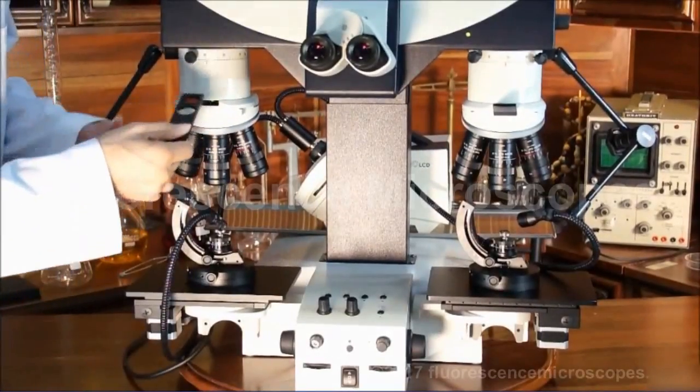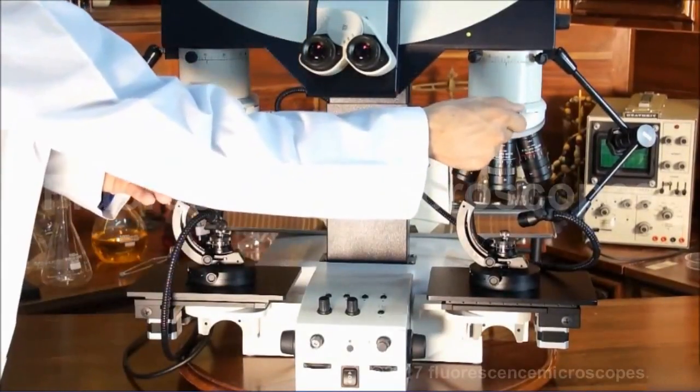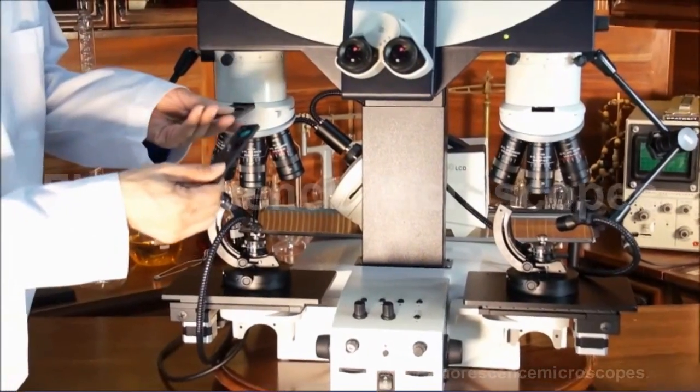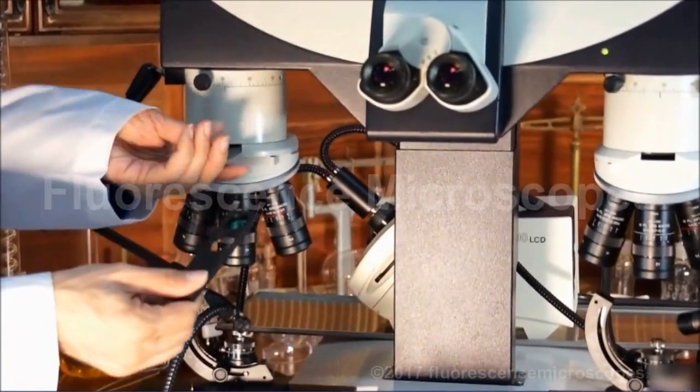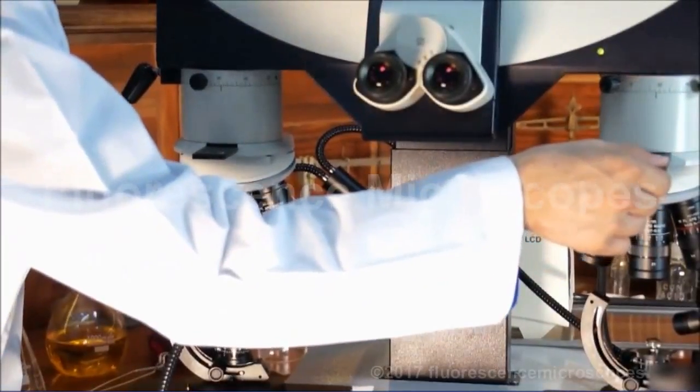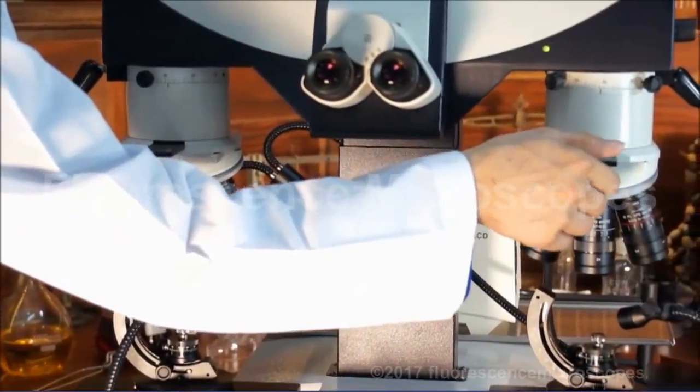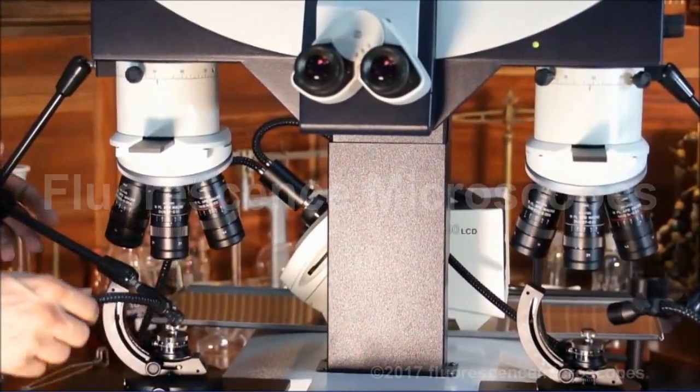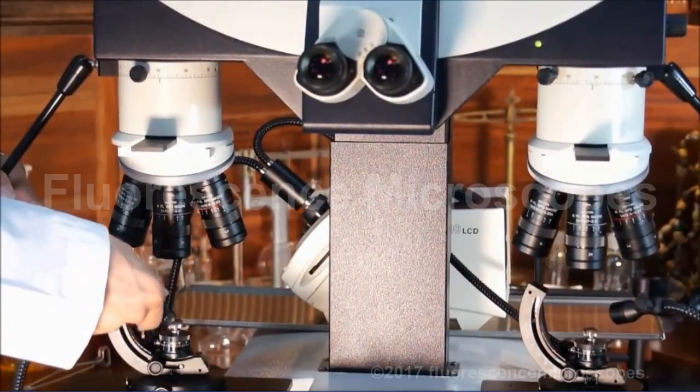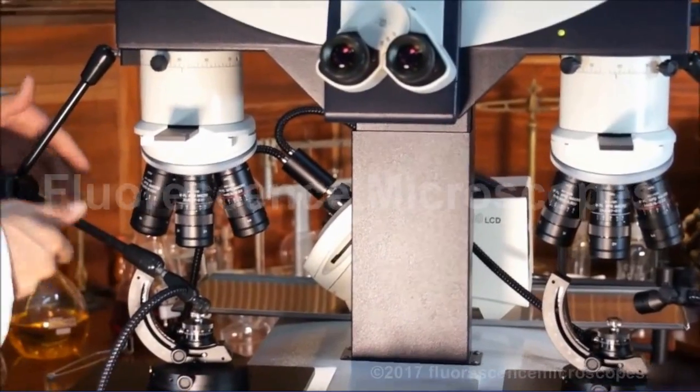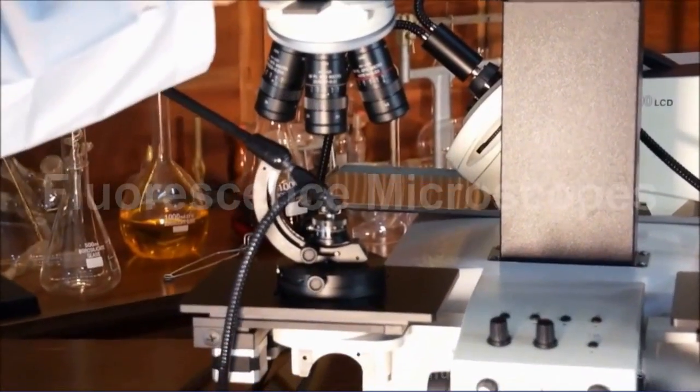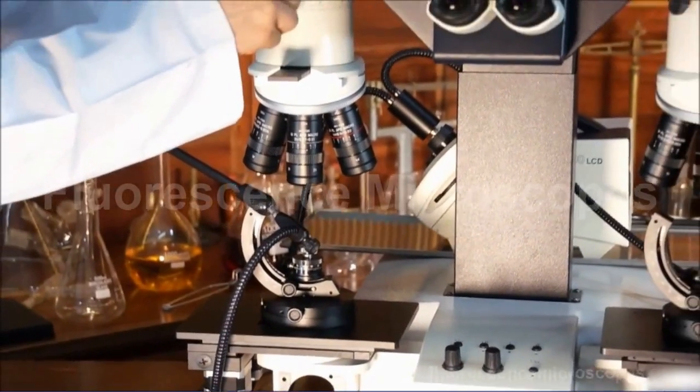This does have some inserts. You may or may not want those. It's got the light holder. You adjust the light holder with these knobs, and you can rotate it from up here.